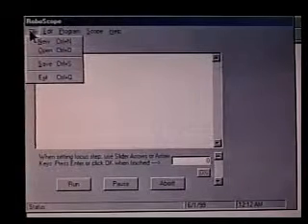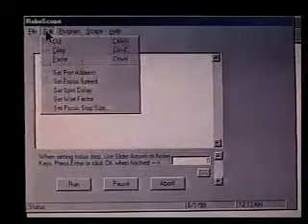Under the File menu, you can open existing programs and save programs that you've written.